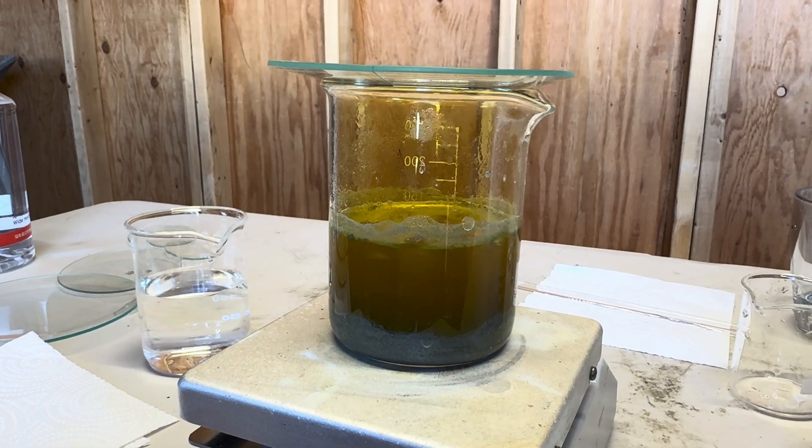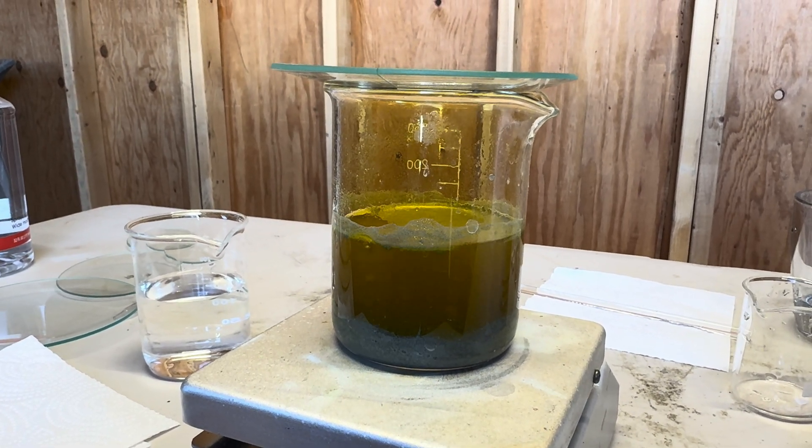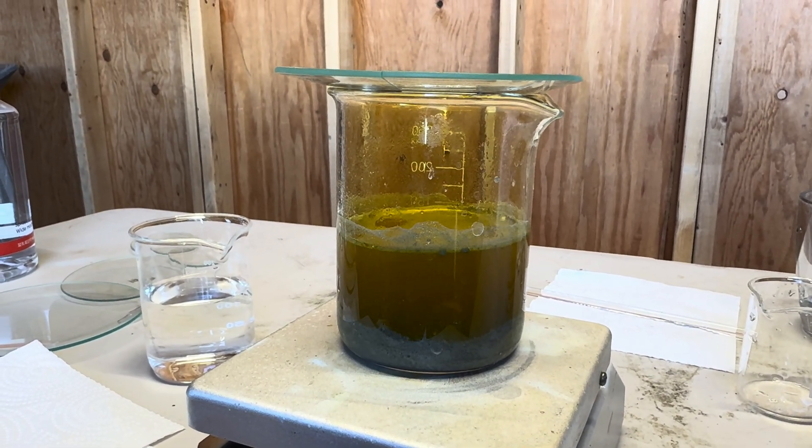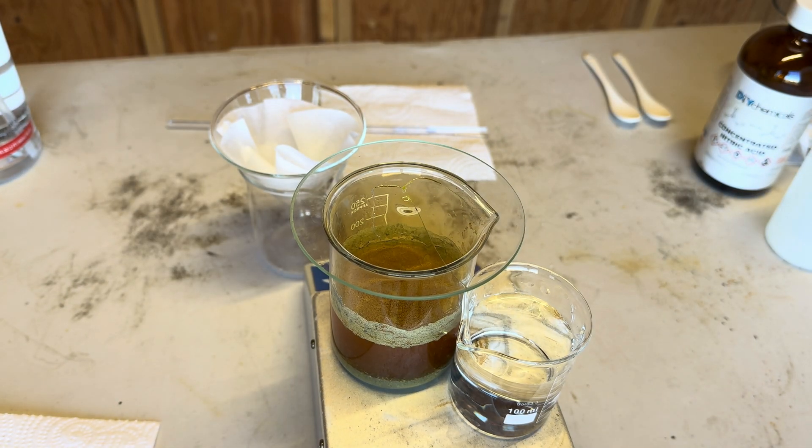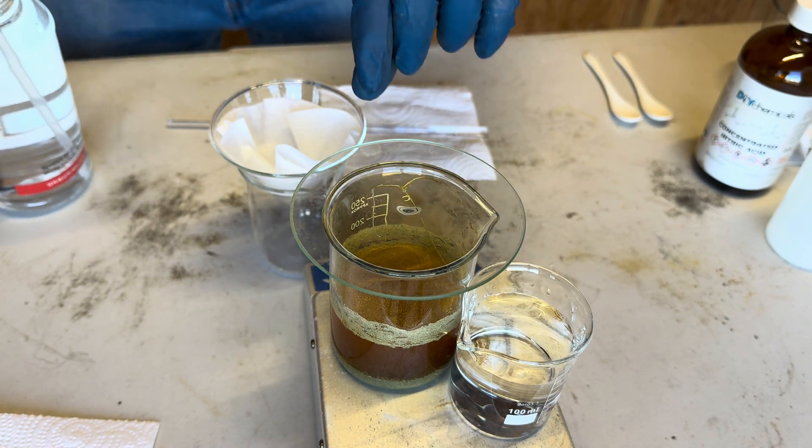At this point I have let the aqua regia boil for about an hour. Now what we are going to do is pour the solution into the funnel so that it will drain into the beaker.